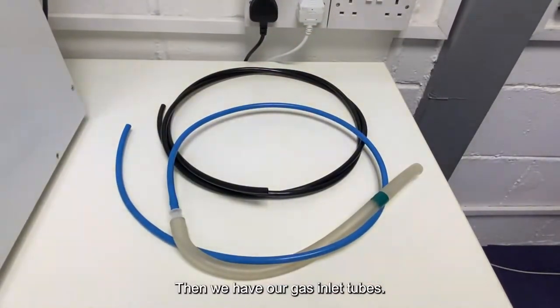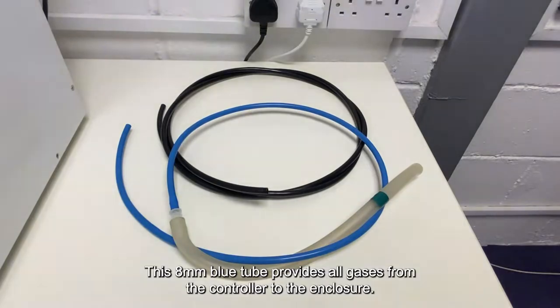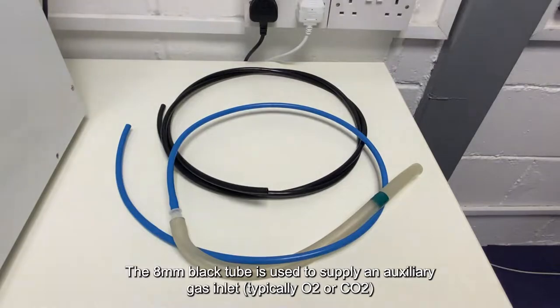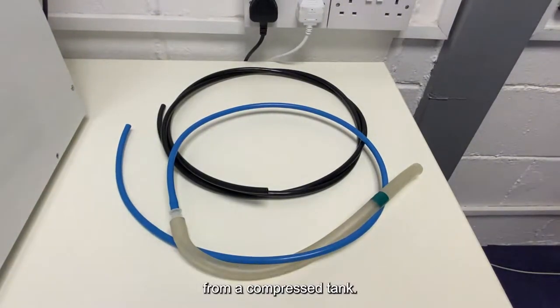Then we have our gas inlet tubes. This 8mm blue tube provides all gases from the controller to the enclosure, and the 8mm black tube is used to supply an auxiliary gas inlet, typically O2 or CO2, from a compressed tank.